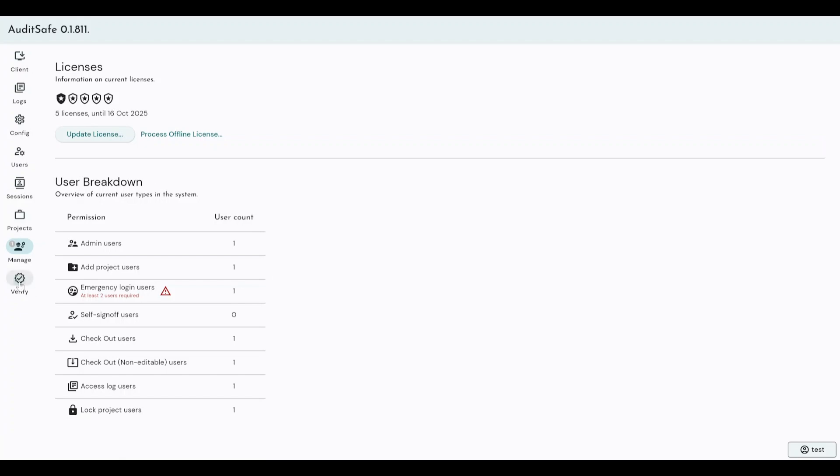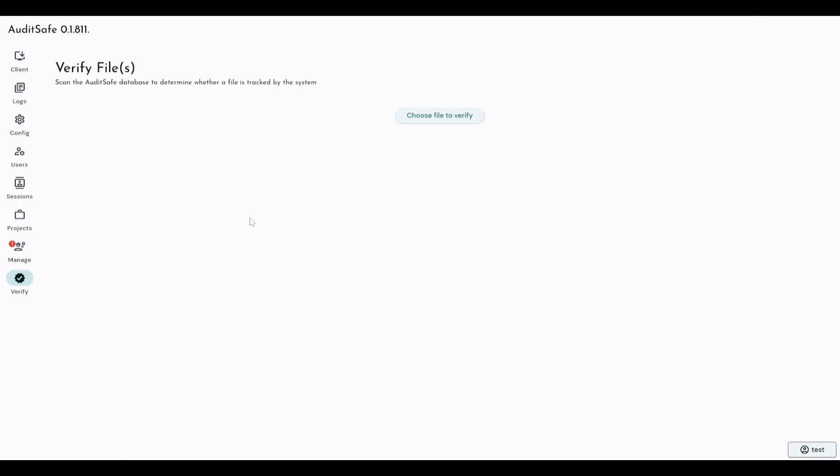And the verify tab is where you would perform file authentication to prove that a file has not been edited once it has left the system. Now, this file authorization file validation system, we're really proud of. So, say for example, if I had finished my analysis and I exported my report as a PDF, that PDF then leaves the Auditsafe regulated system as the final report. However, PDFs are difficult to edit, but not impossible to edit.